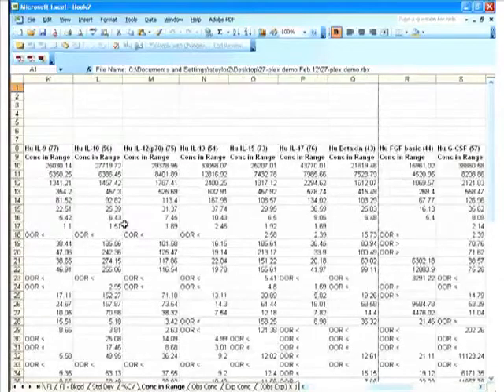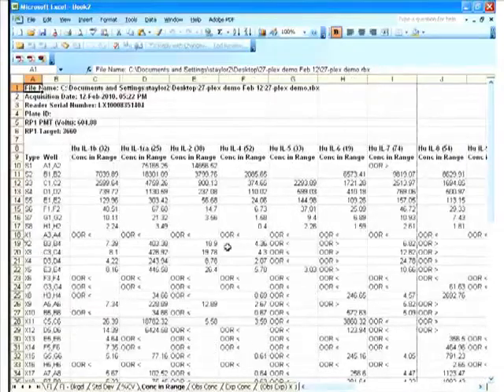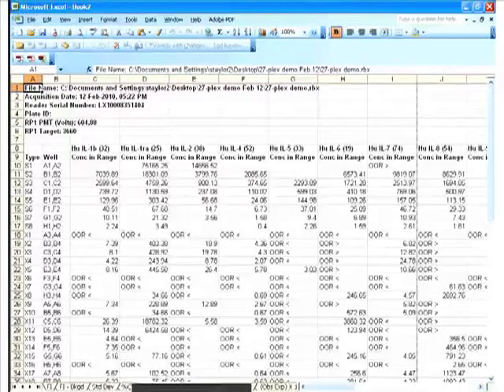So we can see for all the analytes, for our data, how the concentration changed between the various analytes across our samples. So very powerful ways to represent your data so that you can then easily plug these data points into statistical software to analyze further for p-values and t-tests and these kinds of things. So, two different ways to export data. Single analyte, I prefer this multiple analyte to export.